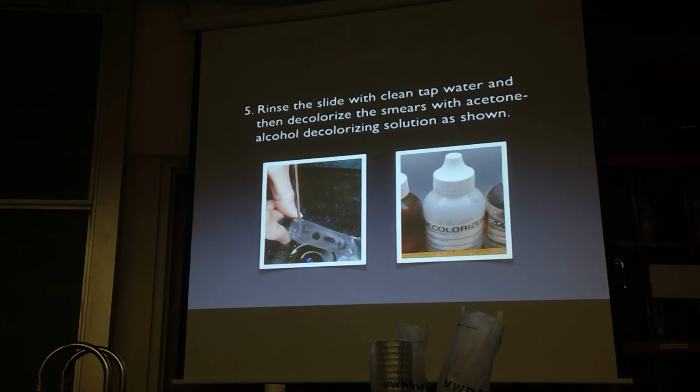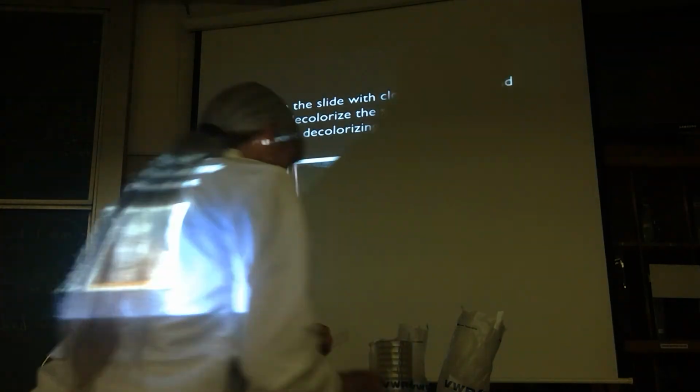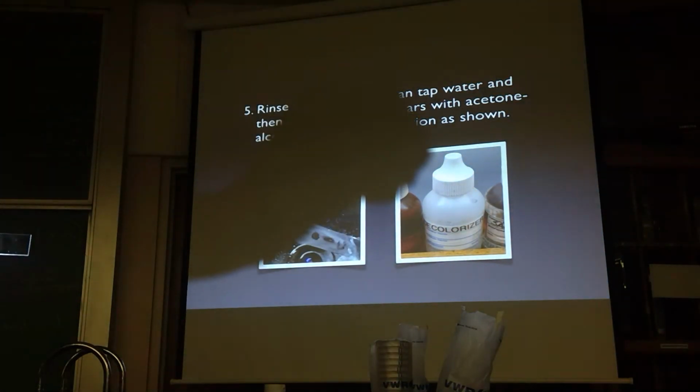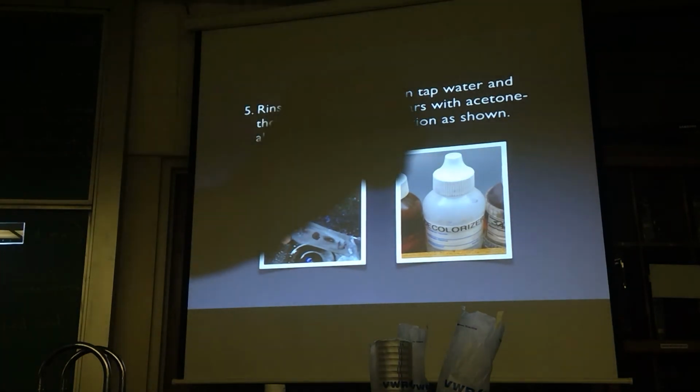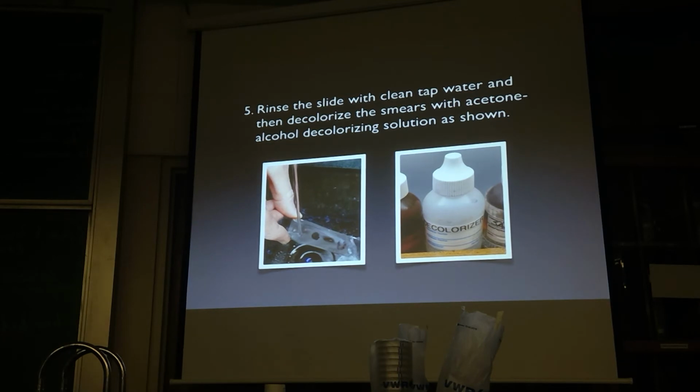You have to hold the slide so that it's in a kind of a vertical position. I'm going to get a slide here. You want to hold it like this. You can see that? This way, not this way, this way. Not that way, this way. And if you can, have something white behind it. That's why we have this white conduit. Unfortunately, it doesn't go all the way to the end.